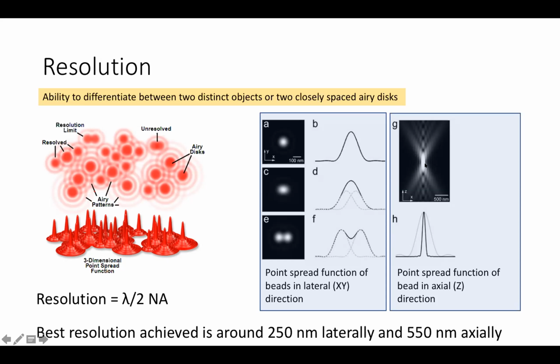And if you want to do a good Z sectioning, you have to collect enough Z stacks, and also you want to maintain the gap between each Z stack such that you can avoid these patterns when you do a 3D reconstruction. Okay, now when I said that you get this resolution, you only get this resolution when you are using the best objective and the best image acquisition settings. If you don't use that, you cannot get this good resolution.